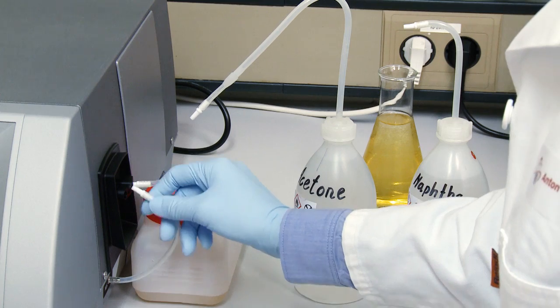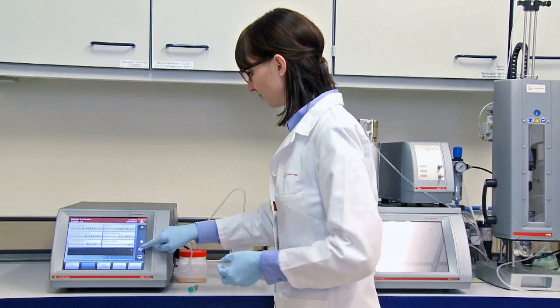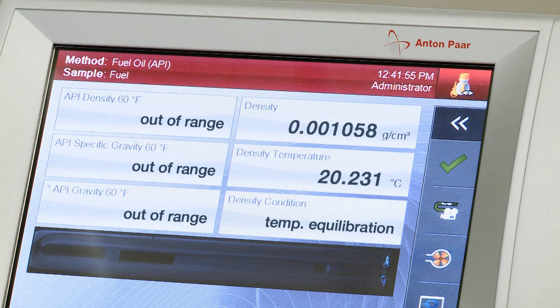Now we can dry the measuring cell. Why do we want to dry the measuring cell? Firstly, because I don't want to mix the previous sample with the next one. And secondly, because I can then let the instrument automatically check the air density after the measurement. A correct value indicates that everything is in order.